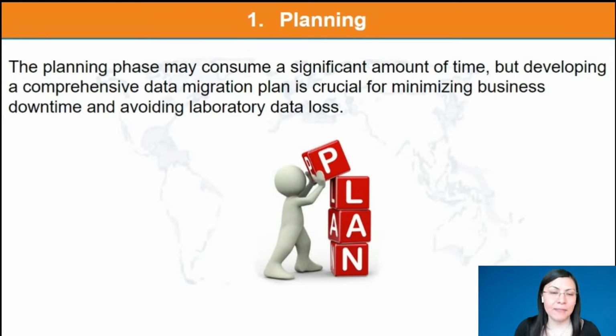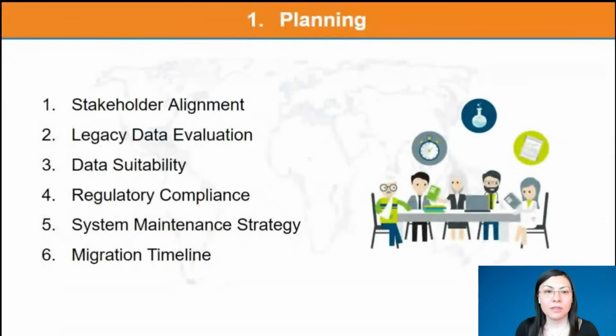money and time. Also, if you have a good and reputable LIMS vendor, they will assign a project manager to your lab. Then they will assist you with any concerns or any challenge that arises during the migration process. While planning a data migration, we need to consider the following aspects. The first one is the stakeholder alignment.